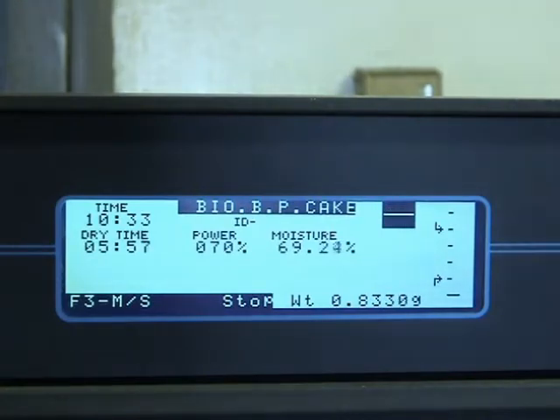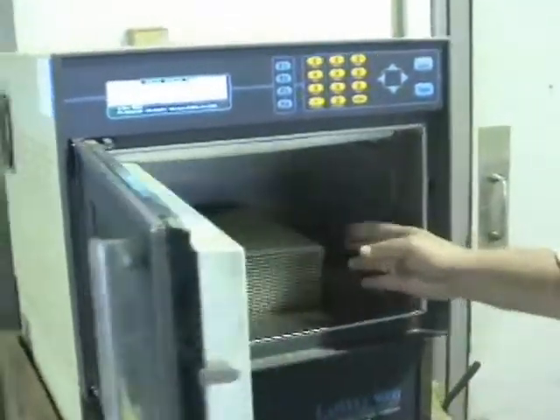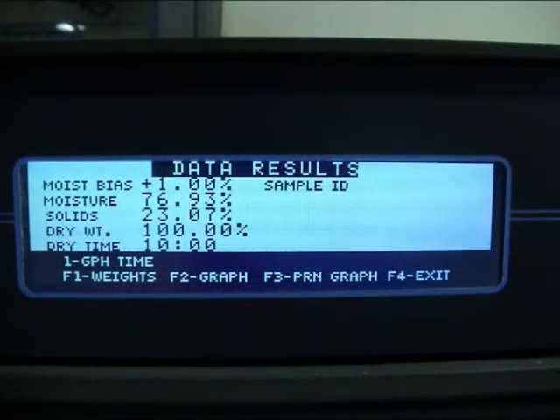At the end of the program, the display presents several bits of information: moisture bias, percent moisture, and percent total solids.